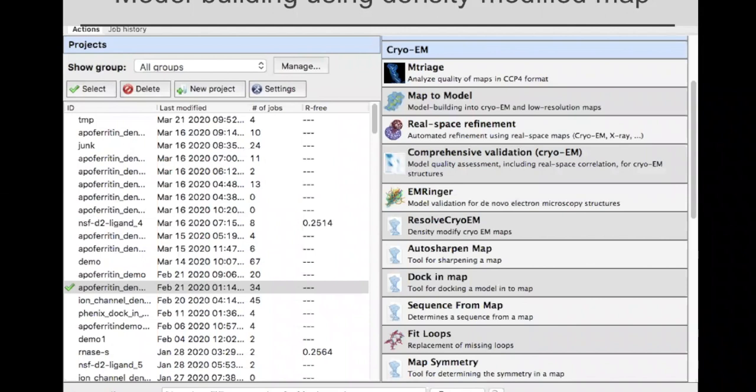These are great questions and very important. So the basic answer is going to be as unprocessed as possible, but still the best looking maps that you can have that are as unprocessed as possible.